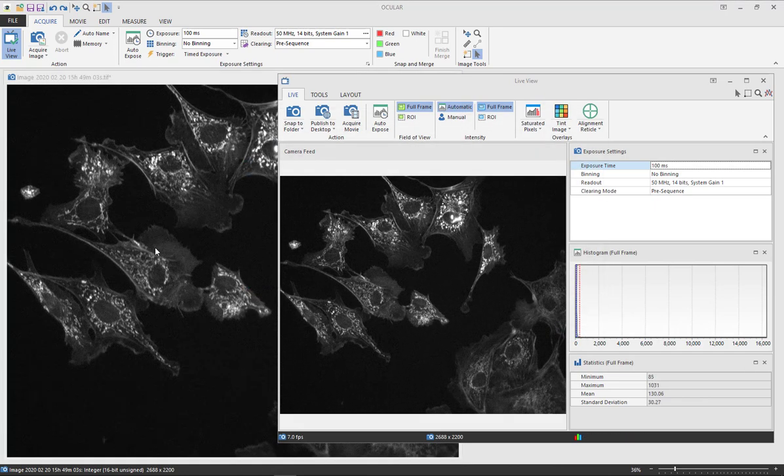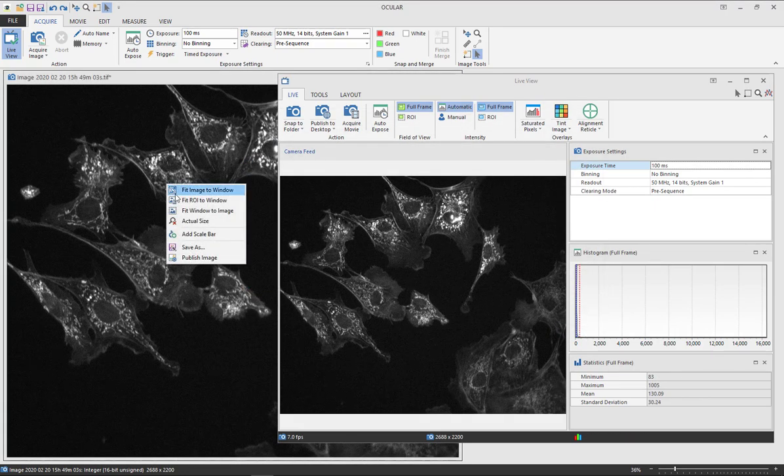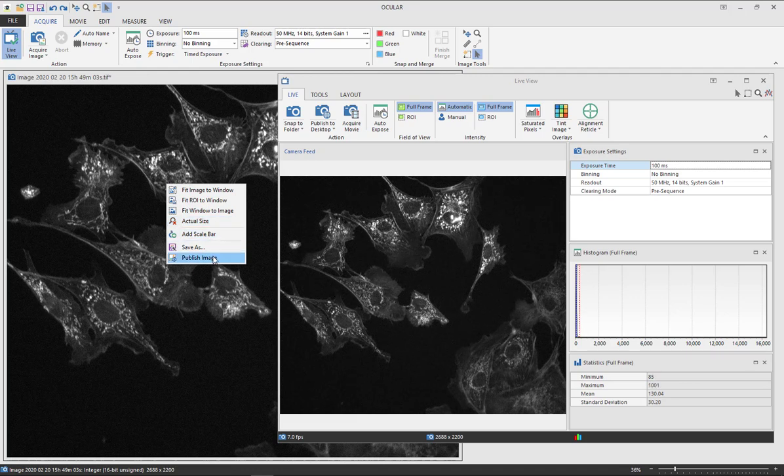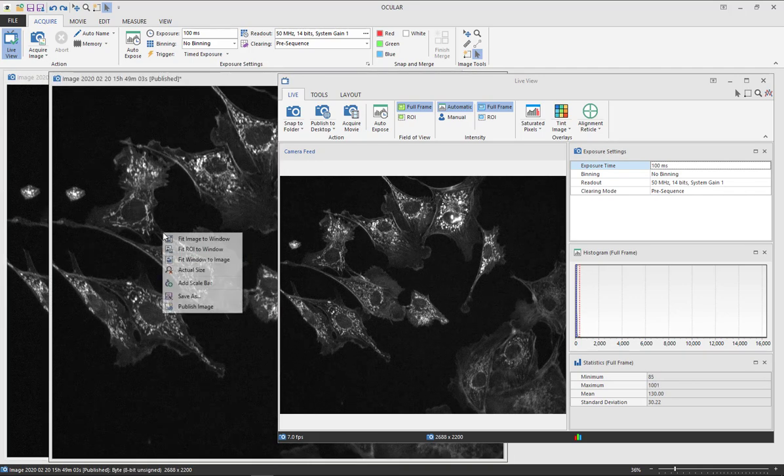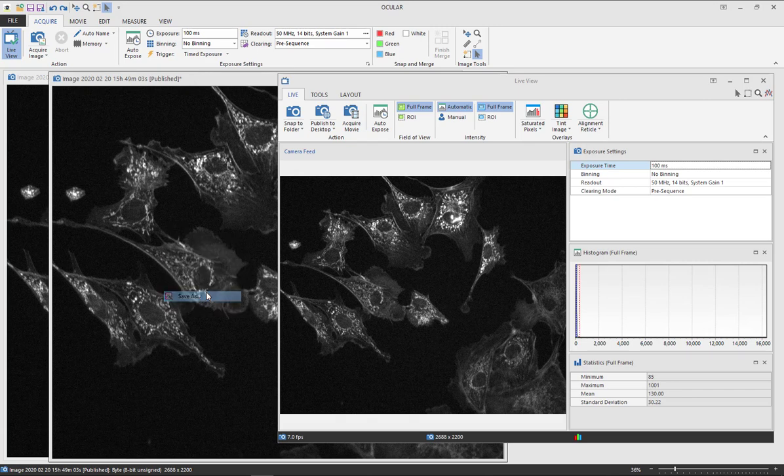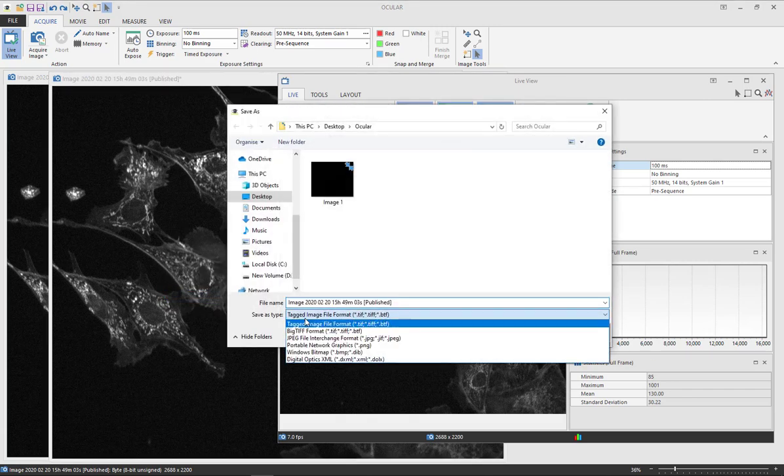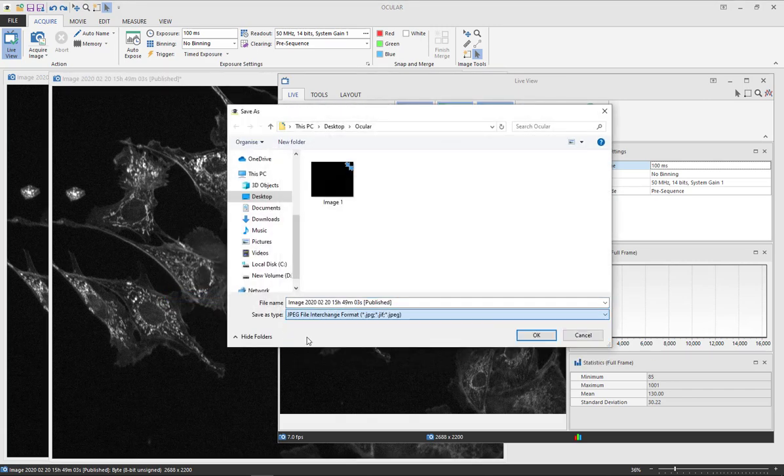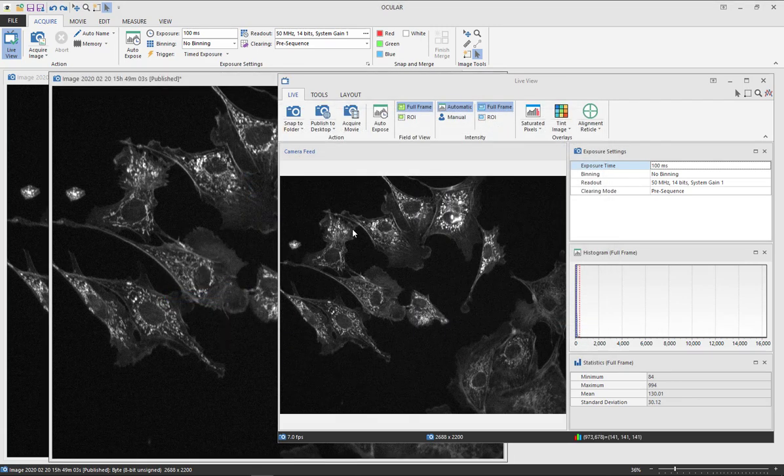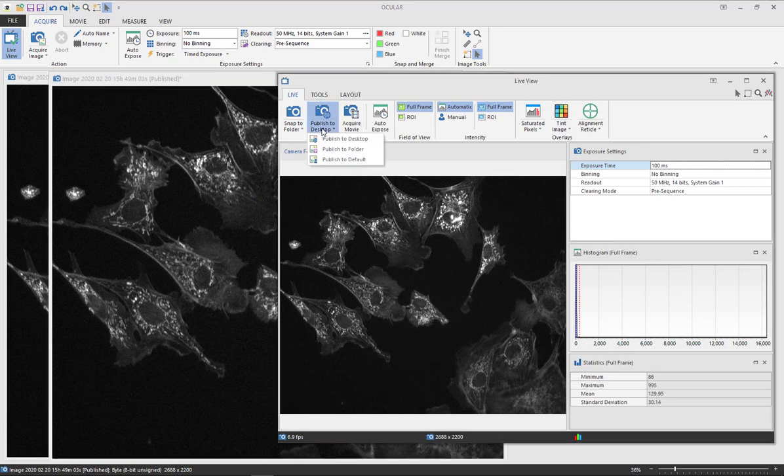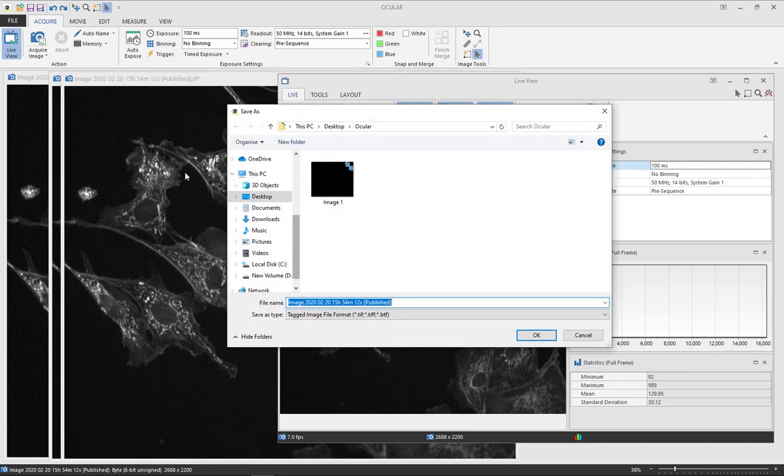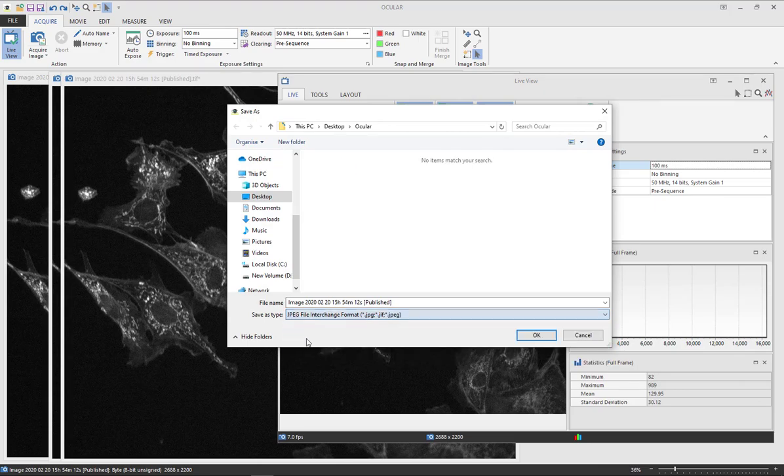If you want to compress your image you can do this by right-clicking on your image and selecting publish image. This will allow you to then save as a JPEG. Again, there is an option to directly publish to a folder and save as a JPEG.